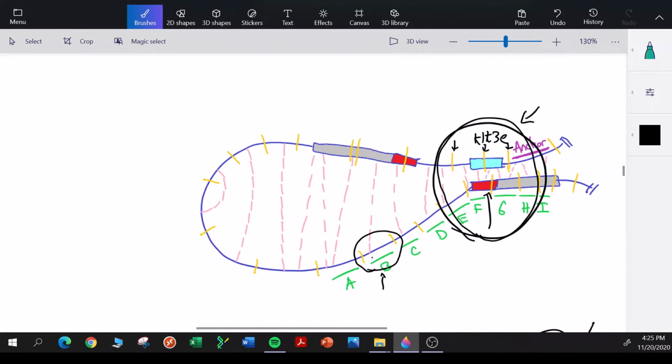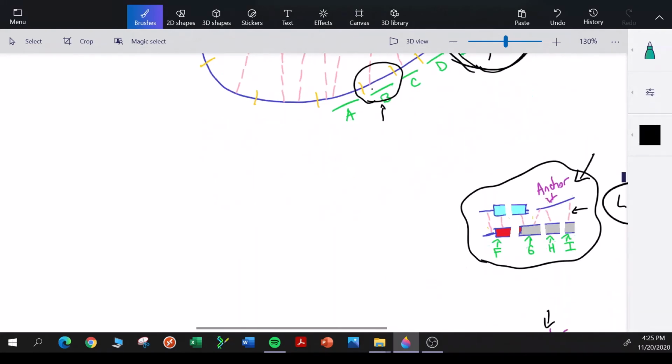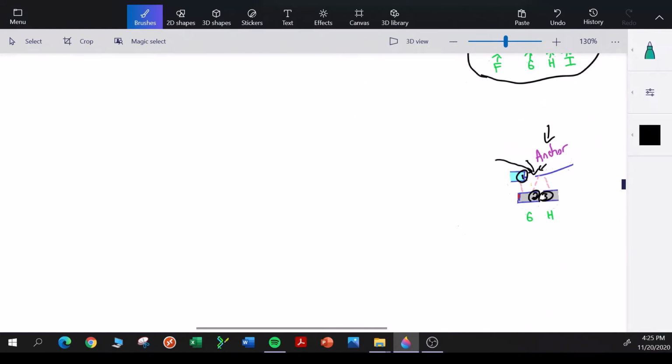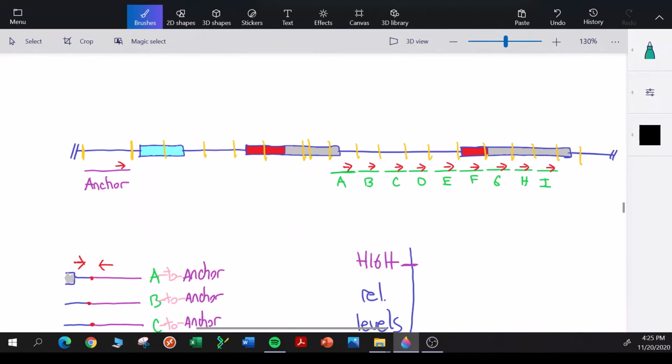If we see B interacting with the anchor, then our hypothesis is wrong, and we would have to come up with a new explanation for the 3D conformation of the KLK3 enhancer relative to its target genes. So, back to our original map showing the various BstYI sites in the various segments we're looking for.